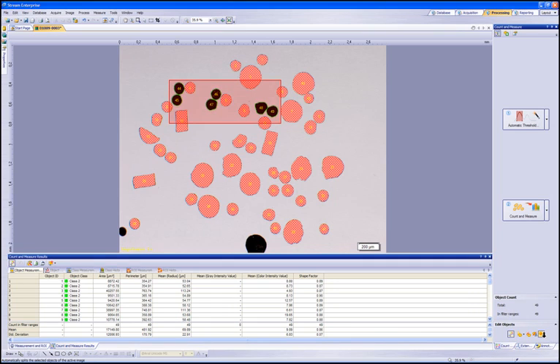Now select the Auto Split function again to run on any particles that it can determine need to be separated. Once it has performed any changes, those will be shown as new separated particles. And again, the object measurement list was updated.